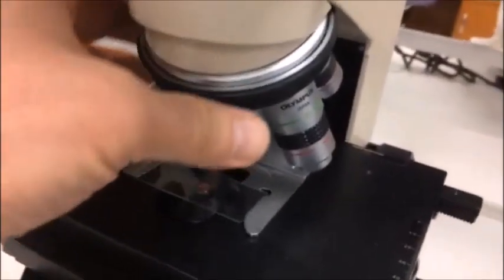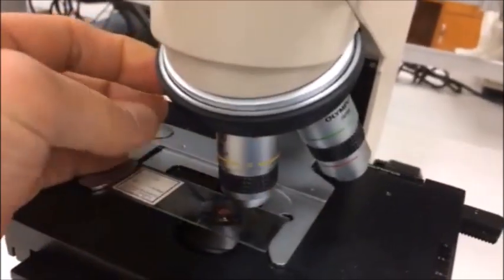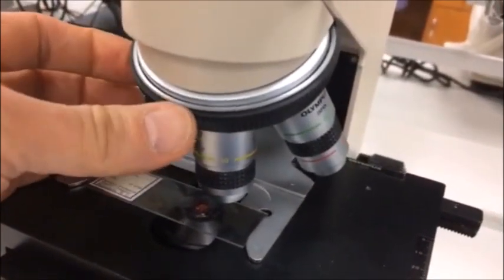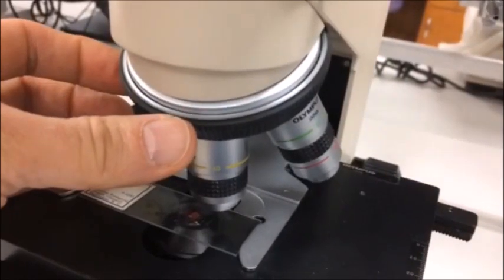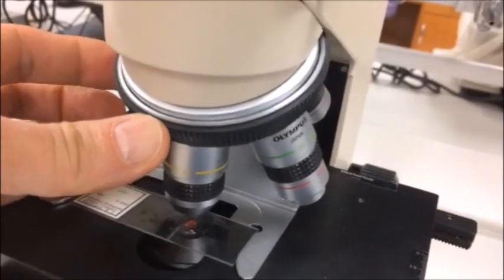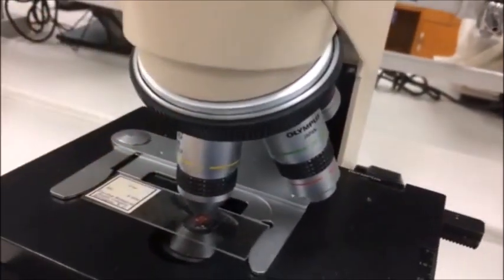The other thing is that the objective lens is actually in a rotating turret like this, and if you don't have the lens clicked into position, then you won't be able to see anything. So listen. I don't know if you could hear that, but there's actually a clicking sound when it's in place.